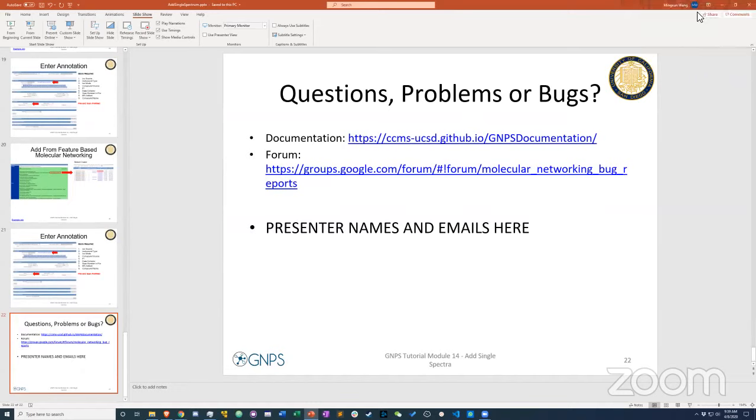Yes, and thank you for showing the workflow for uploading the spectrum. I'm Hugo from Switzerland, working at the Aquatic Research Institute. I have a question about uploading the spectrum for the data. You showed, if I understood correctly, how to upload one data set, right? For example, if I have 10 or 20 or 30 or many compounds or many data sets, if possible, I can do batch mode. Then I don't need to click many times.